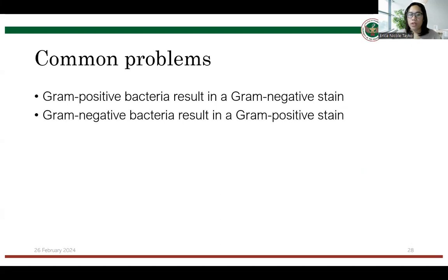Okay, so the point is sometimes due to the errors in performing the gram staining technique, there is a possibility that you actually obtain discrepancy in your results. So as much as possible, you follow the prescribed contact time, even the contact time of the mordant and the decolorizing agents, so that you will get accurate results.